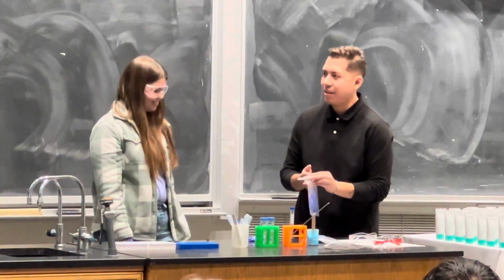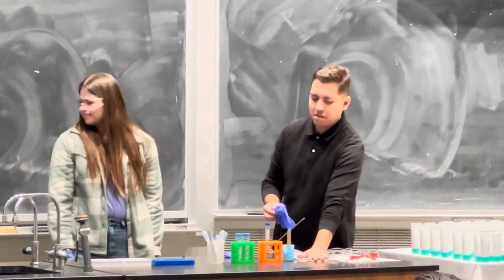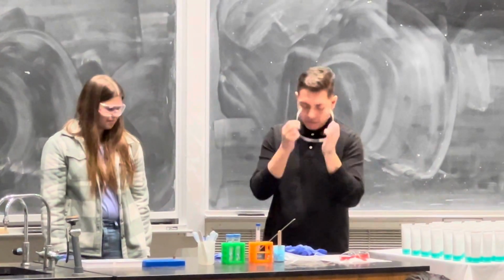Am I doing it? Am I showing her what to do? Yeah, go for it. Well, put your PPE on and then we're going to homogenize the sample. And then I'll just tell you each step. Thank you.